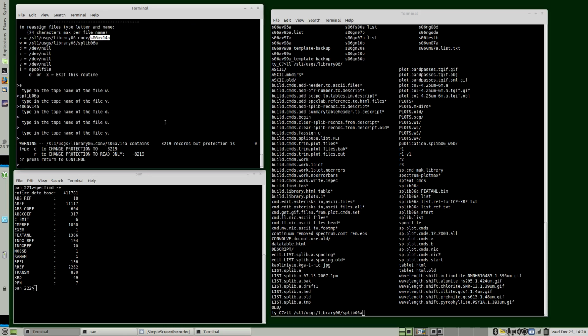Okay, now SpecPR has three ways you can have a file in terms of reading and writing. If the file protection is a negative number, it's read-only. We have a convention that if a file doesn't exist in your current directory, SpecPR assigns it as read-only.